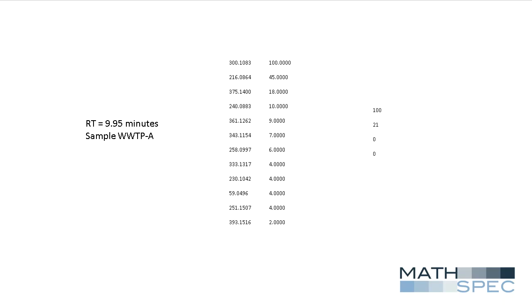In the approach that was described in the paper, the isotope pattern and the accurate mass of the precursor were derived from the MS full scan spectrum, while the masses and intensities of the 11 largest fragment ions were collected from the corresponding MSMS spectrum. Now the first step is to analyze the mass spectral data with our Excel add-in. This add-in generates modular structures, which are rough approximations of the molecular structure.